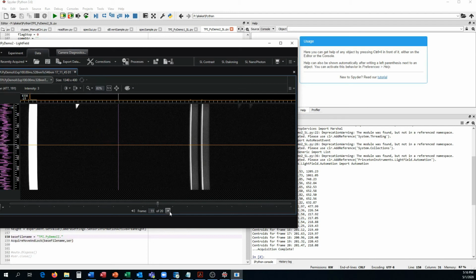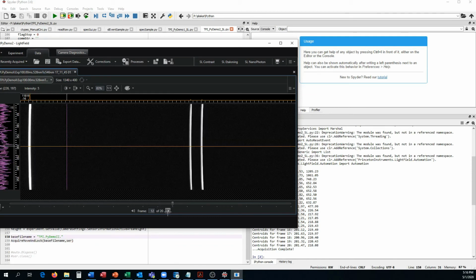And as we keep moving it, as the peaks become more defined, as we're getting closer to the position we want, now the centroid is moving. Now it's at 226. So here now, 226. Let's just keep going, and the centroid settles in around 219, 220. So where's 219?